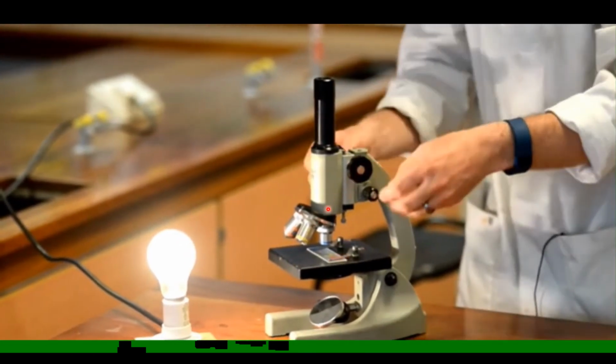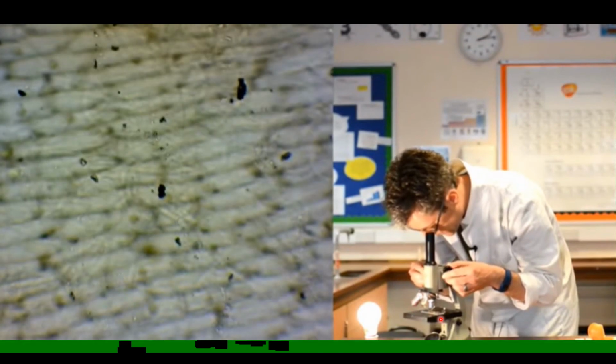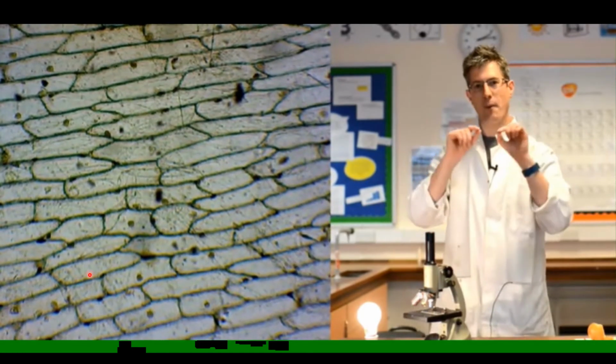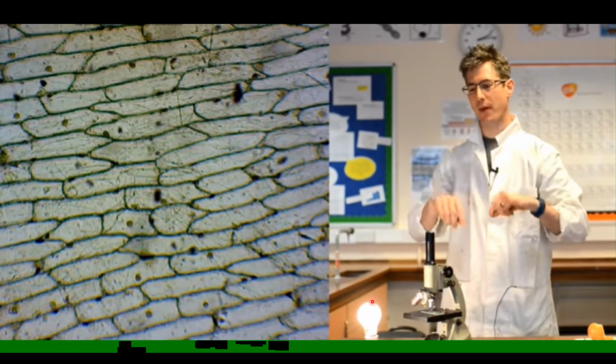දැන් මේක අවනෙත් කාචය, අවනෙත් කාචය මේ නිදර්ශකයේ ළඟට ගෙනාවට පස්සේ eyepiece එක මත ඇහැ තියලා මේ coarse adjustment knob එක මගින් මේ විදිහට පැහැදිලි නිදර්ශකයක් හම්බ වෙනකන් ඒක adjust කරන්න තමයි තියෙන්නේ. So this is the first step that you can follow to observe a clear image.